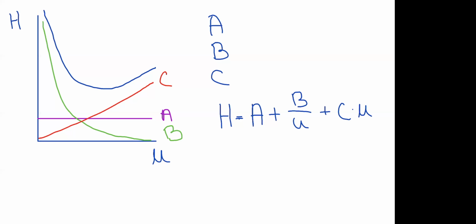So this actually shows us a few things. It tells us what kind of column we would like to have, what kind of a chromatographic system we would like to have.